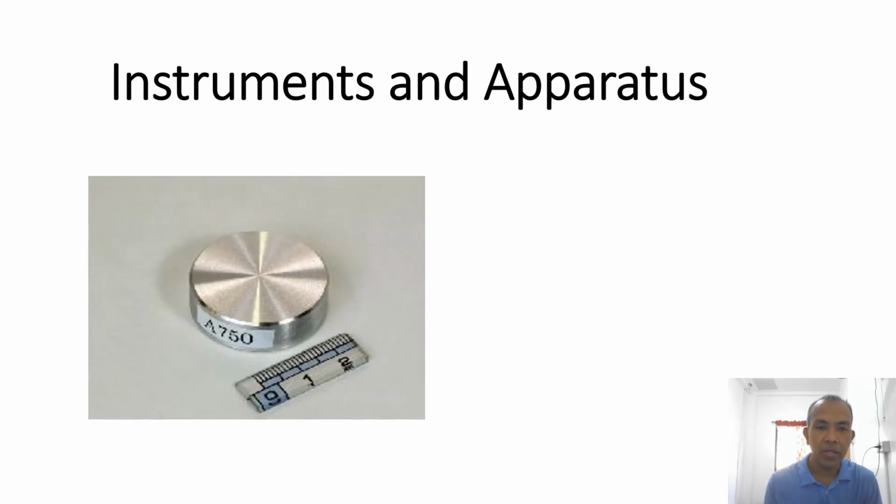So this is the calibrating chip. According to the Shimadzu engineer, the coverage of EDX is sodium to uranium. So antimony is in the middle. But in their calibration using this, antimony was not itemized. Their explanation is that antimony is lighter. But it doesn't mean that it was not itemized in calibration.